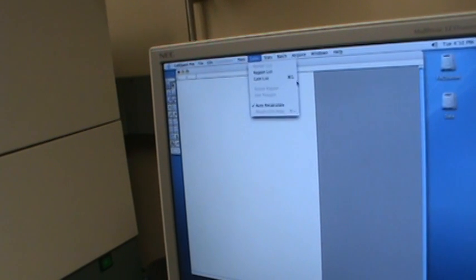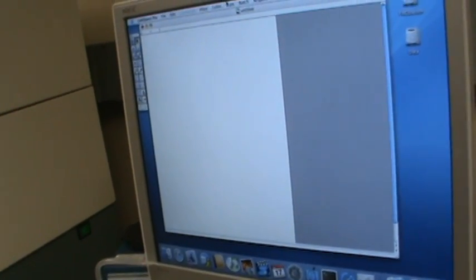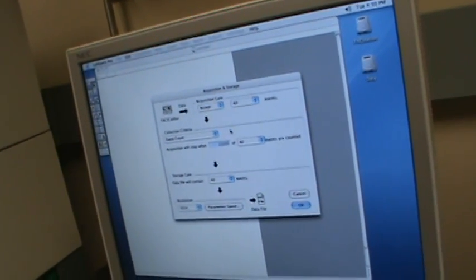Depending on what you're working with, the first thing you would go to is you want to open any type of instrumentation or file settings. Okay. So I don't know if you have instrumentation settings already. I don't have it. Okay. Yeah. So what are you working with? Each cell. What are you doing in your experiment?